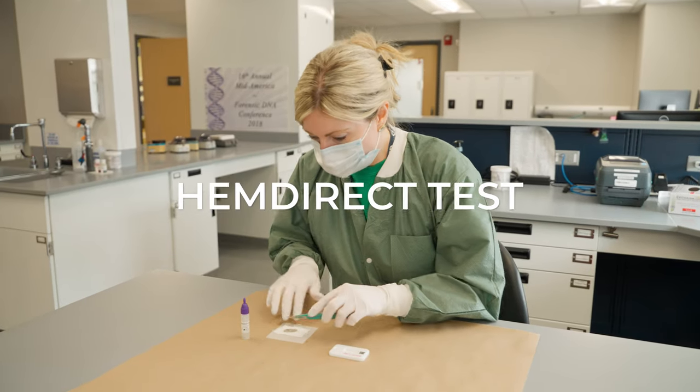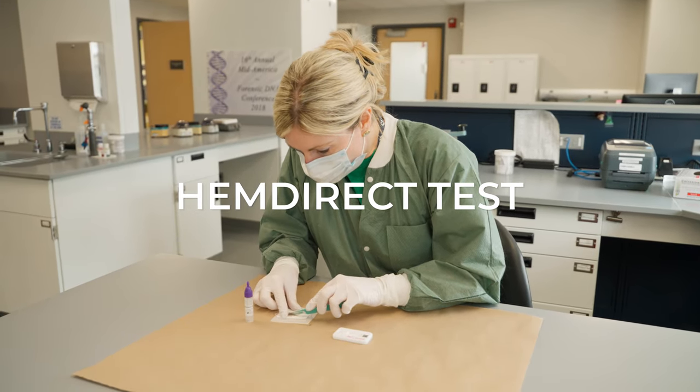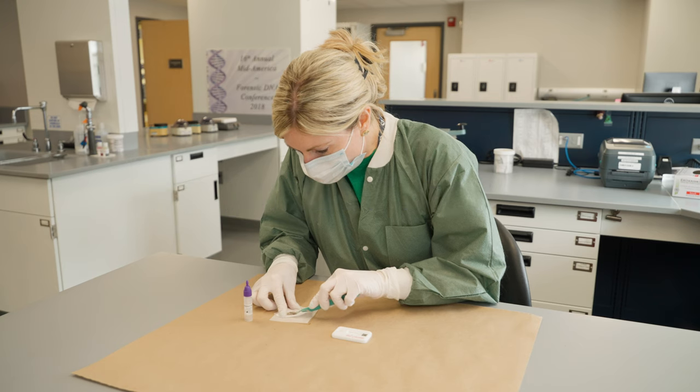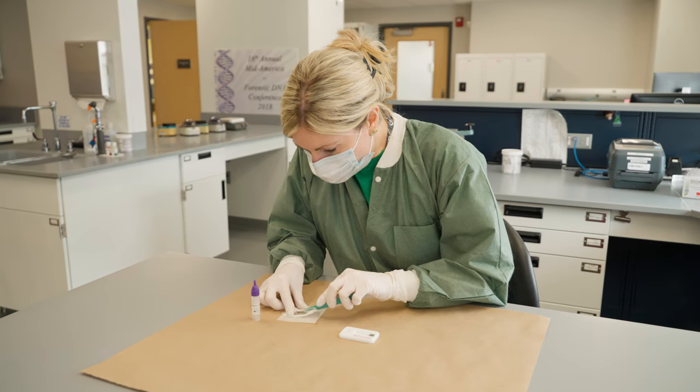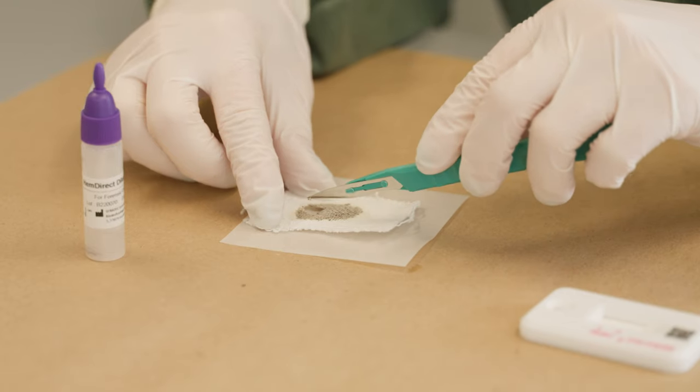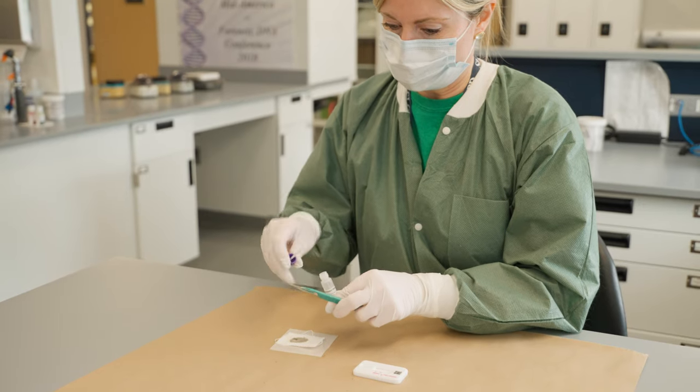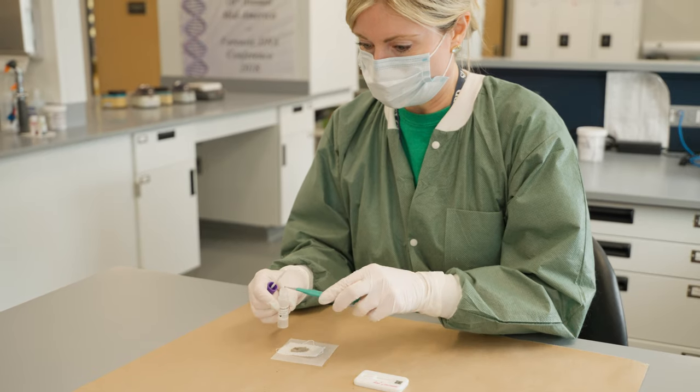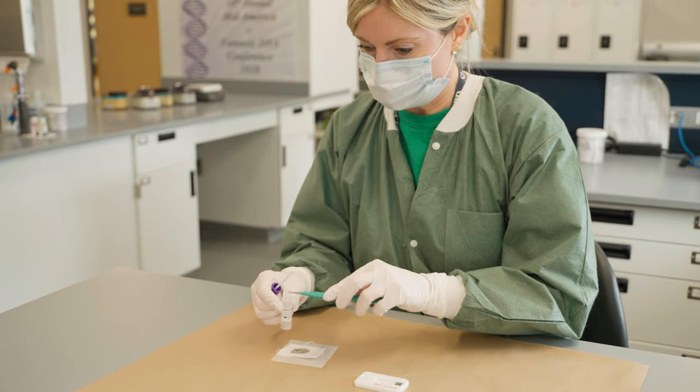The heme direct test works similar to a COVID test and is a confirmatory test for blood of probable human origin. It is not considered a confirmatory test for species due to the fact that some upper primates and under some conditions ferrets have been reported giving positive results with the heme direct card.